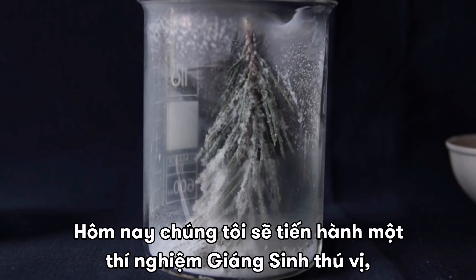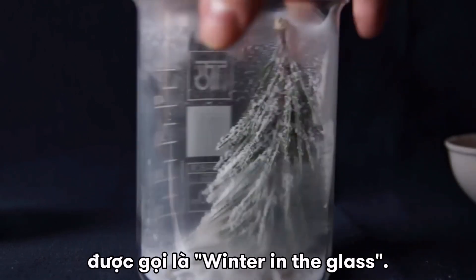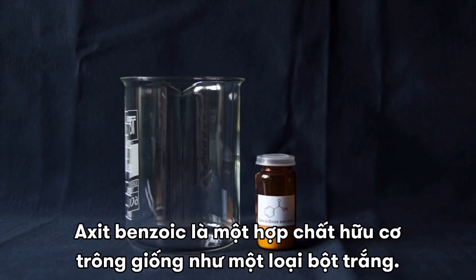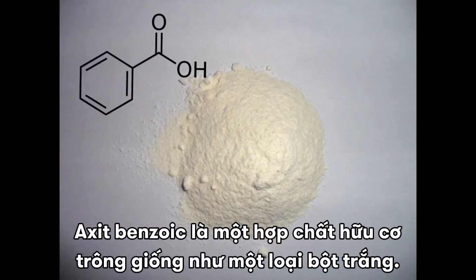Hello everyone. Today we'll conduct a very interesting Christmassy experiment called Winter in the Glass. This experiment is about sublimation of benzoic acid. Benzoic acid is an organic compound that looks as a white powder.